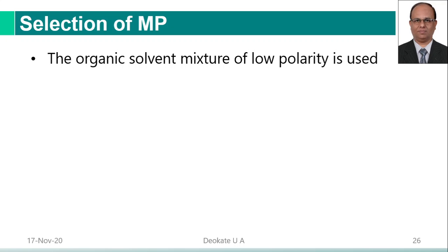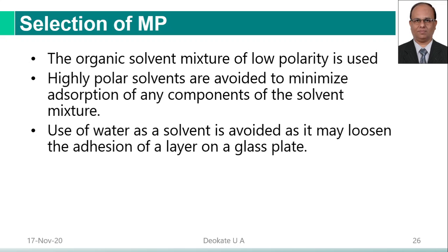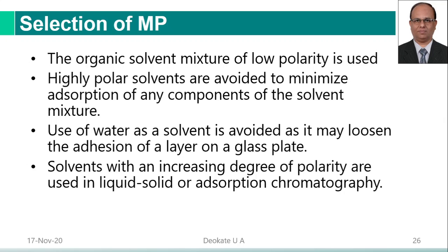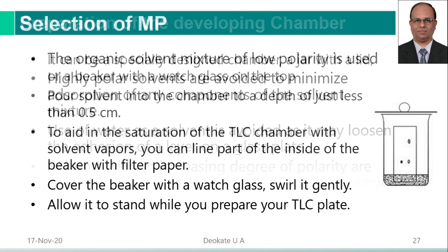So selection of mobile phase: an organic solvent mixture of low polarity is generally used for this purpose. High polarity solvents are avoided to minimize adsorption of any component of the solvent mixture. Use of water as a solvent is avoided as it may loosen the adhesion of the layer on the glass plate. Solvents with an increasing degree of polarity are used in liquid-solid or adsorption chromatography. So solvents listed in the eluotropic series are selected for the purpose. In the previous video, we have seen the various solvents used for chromatographic purpose.